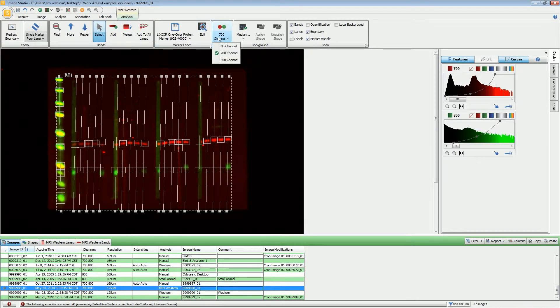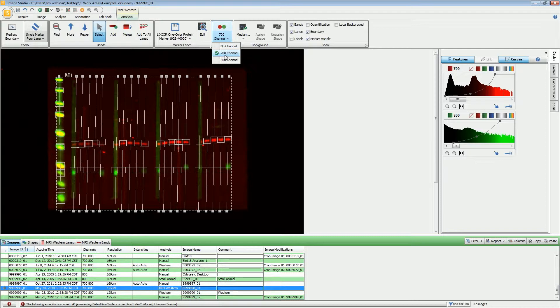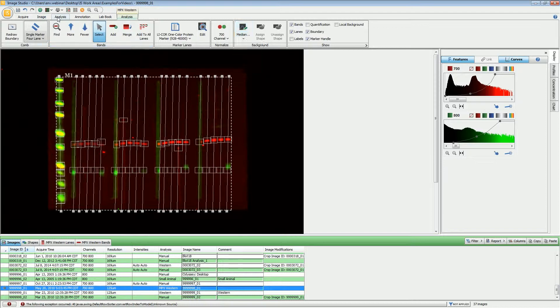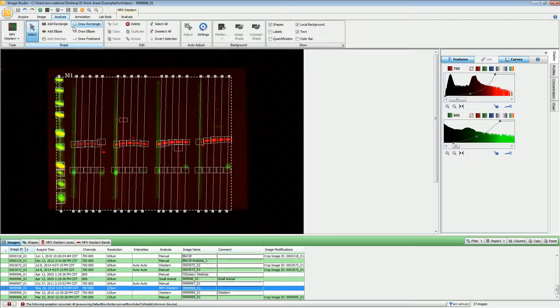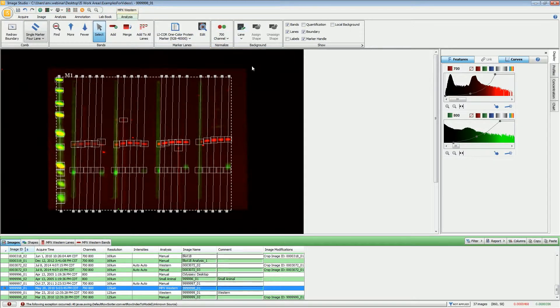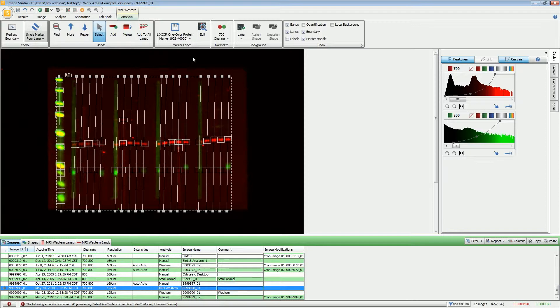For normalization, if you have a normalizing factor in each one of these channels, you can set the normalization. For right now, we're going to go with the 700 channel for the normalization factor. For background subtraction, you can choose median or average, which are exactly the same calculations used if you were to manually edit an image using the rectangles. You can also use the option of lane, which is probably good for most applications unless you have a lot of nonspecific banding within your lane.